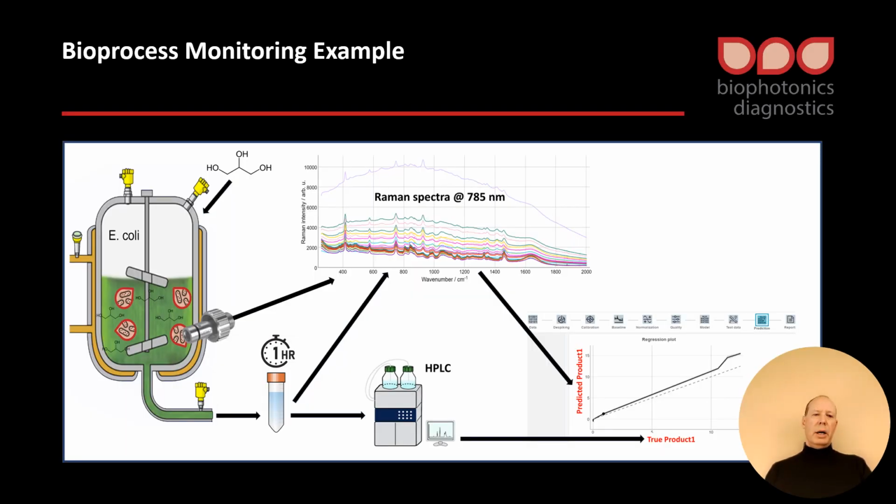The example I bring to show you how easy it is to analyze a complex data set from spectroscopic measurements is a bioprocess with E. coli as organism.